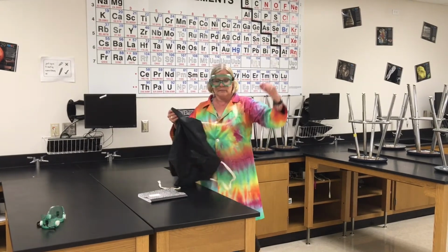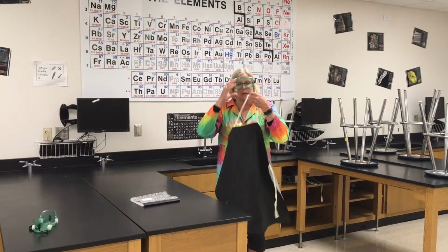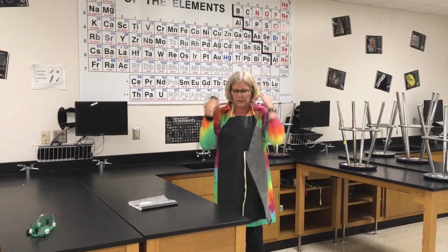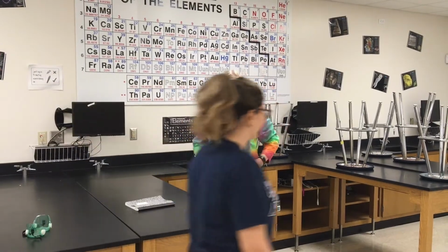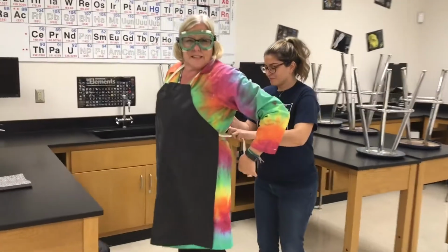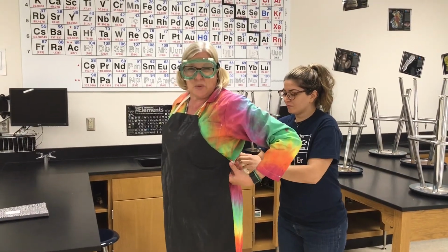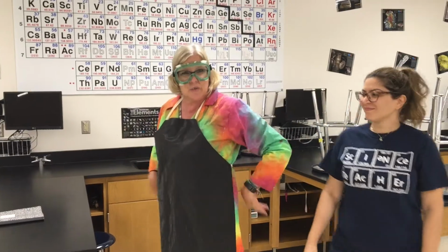Sometimes you might need an apron. And with these aprons, you have to be careful with them. They just go over your head. Probably take off the goggles, then they go over your head, goggles back on. And ask for a partner's help, please, to tie you on. Because if you tie it in a knot, you're going to end up having to try to pull these off, or we could staple them to your body, but probably don't want to do that, so just ask for help.